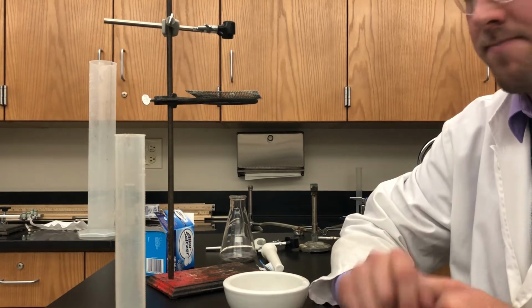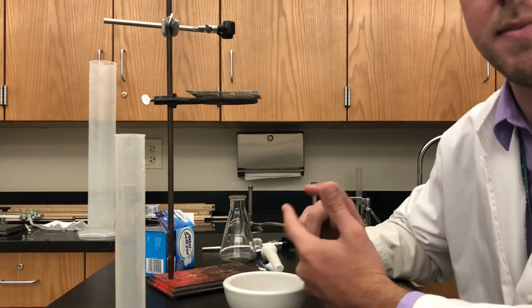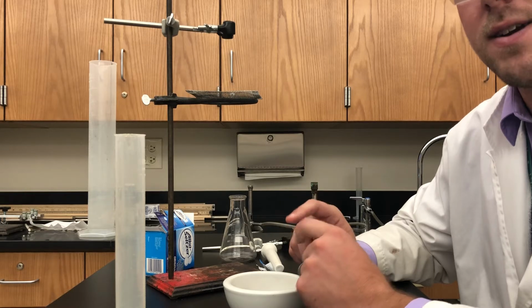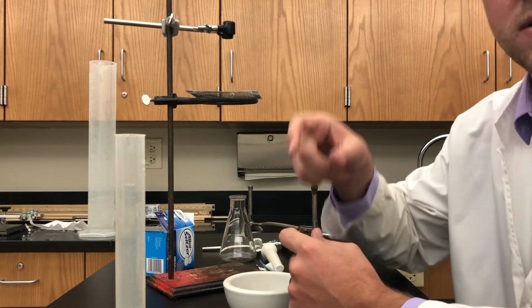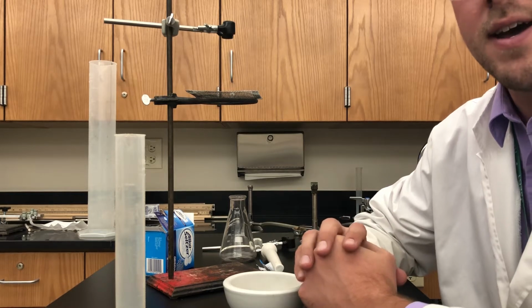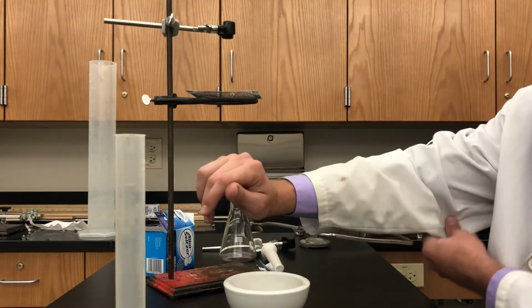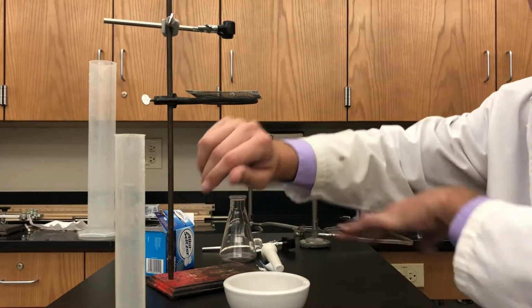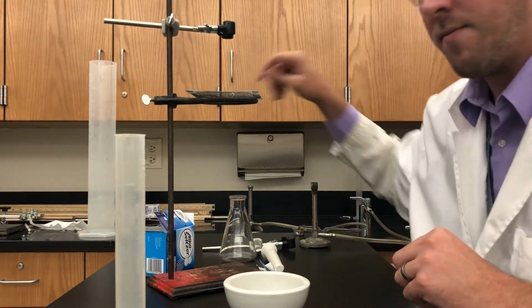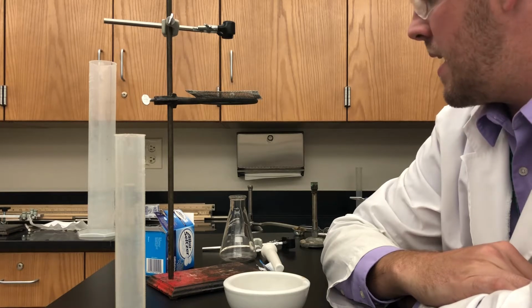So number one, safety. The biggest safety thing has to do with our Bunsen burner. Obviously the Bunsen burner is a flame. Ladies, you need to make sure that you have a hair tie. I think I told most classes, just find a spare one and stick it into your science binder. That's going to be a good way of always having it whenever you need it. Number two, don't wear any really droopy hooded sweatshirts or really drapey sleeves that could potentially get caught in the Bunsen burner if you put your arm near it. So clothing and hair, got to be careful with those.